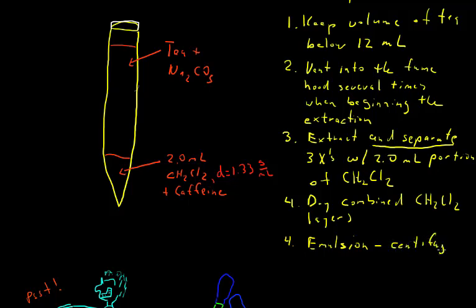And rather than try to explain how to do that there, that's something that I'm going to have to show you how to do. So one last thing to mention, once you've separated the dichloromethane layers, water and dichloromethane are not miscible, but that doesn't mean small amounts of each won't dissolve into the 2 different layers.